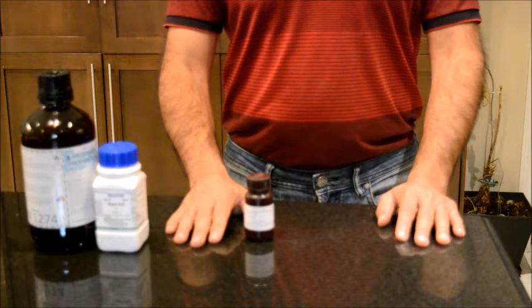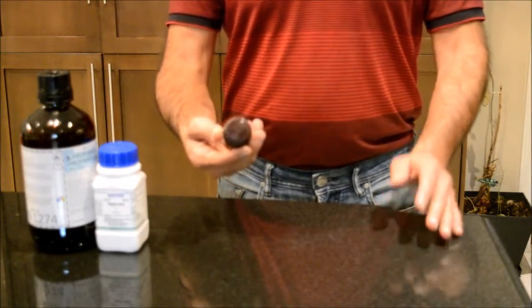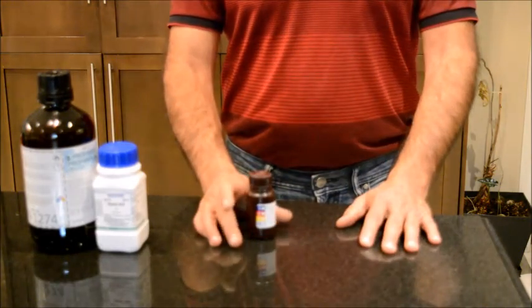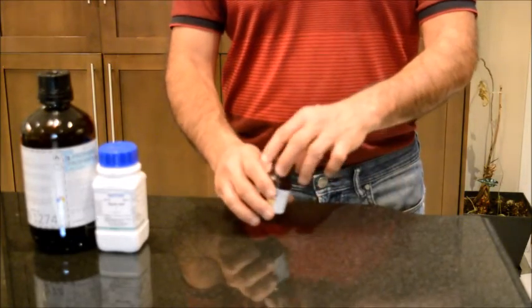Magnesium stearate is mostly used in tablets, and its function is a lubricant. So what it does is that when the tablet is made by a tablet press machine, it will prevent the tablet from sticking to the metal component of the equipment.